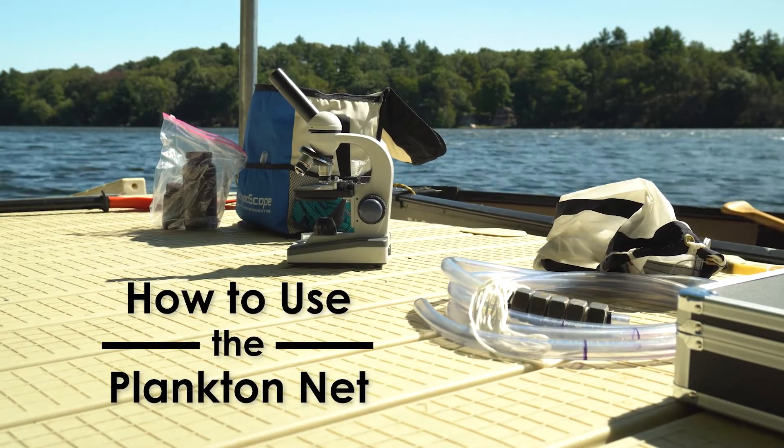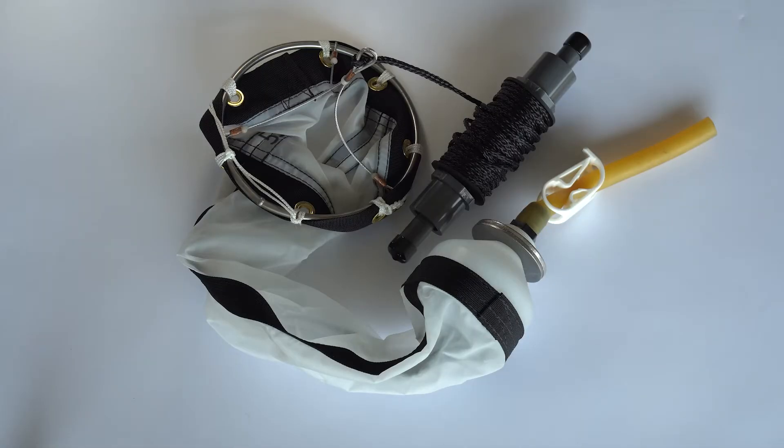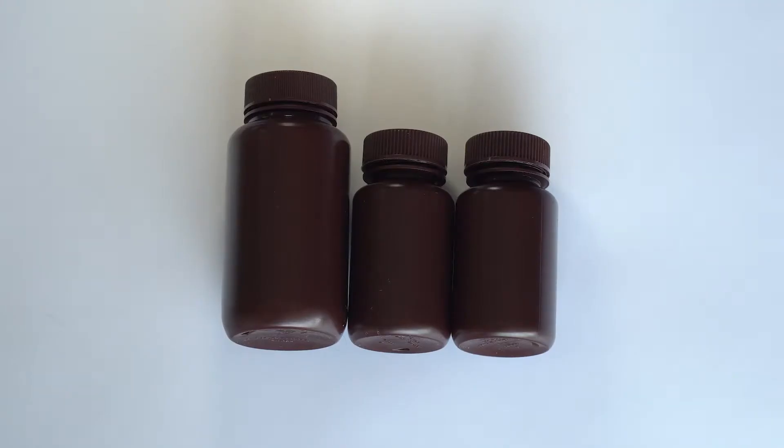This video will demonstrate how to gather samples using the plankton net. For this you will need the plankton net, prepared sample bottles, and gloves.